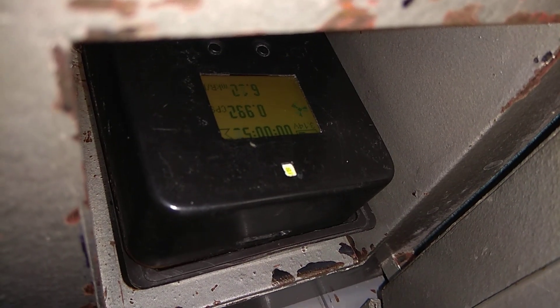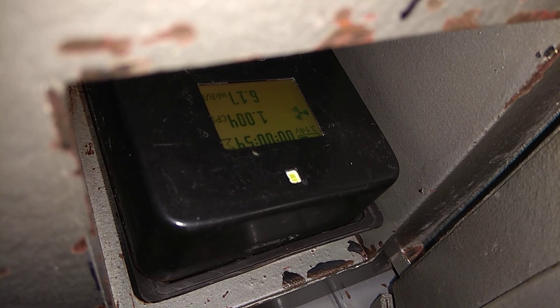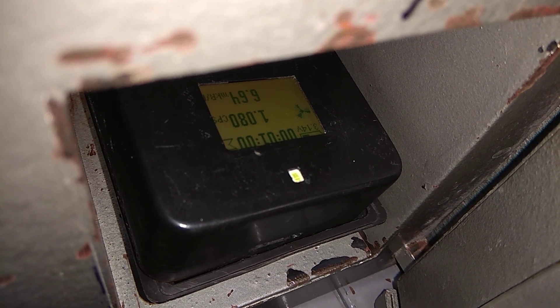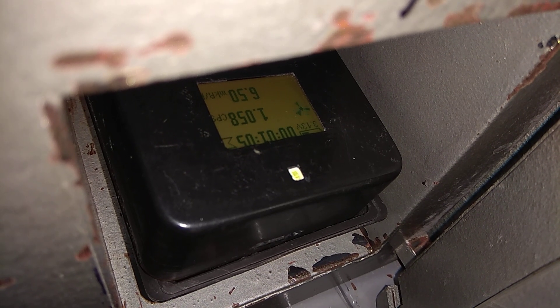Ждем минуту. Открываем, смотрим. 0.99 импульса в секунду, до одного подскакивает. 6 микрорентген в час, максимум 6.6.